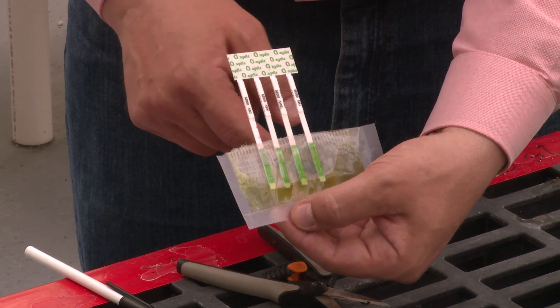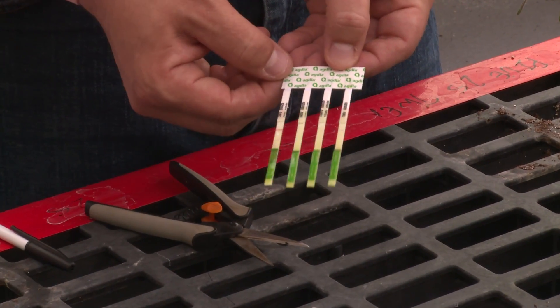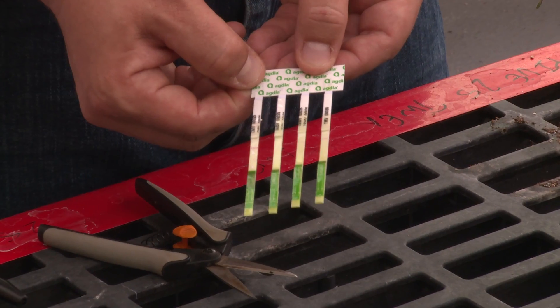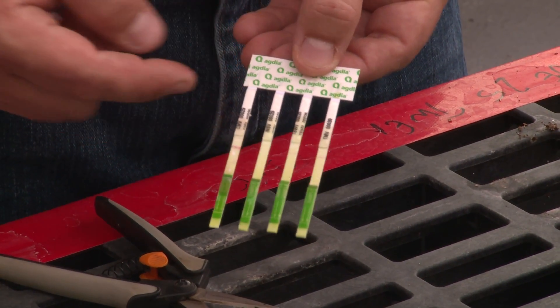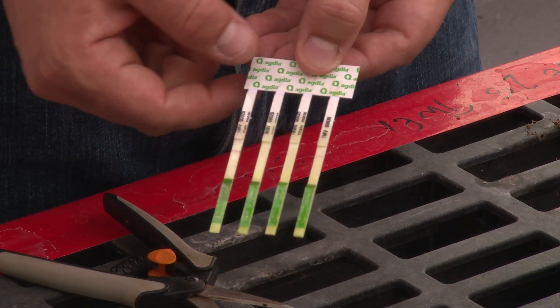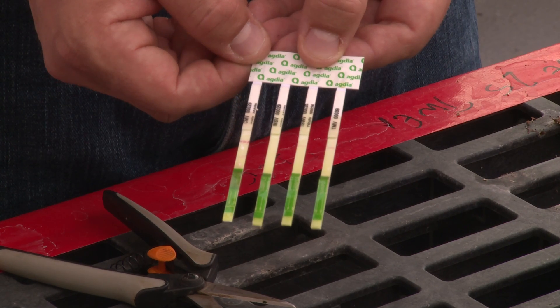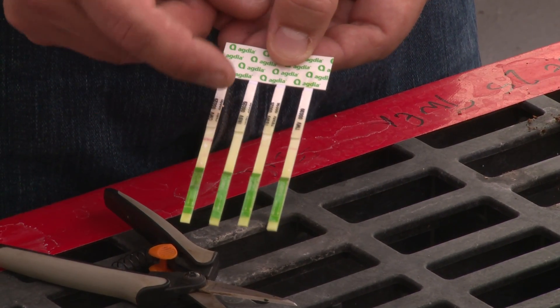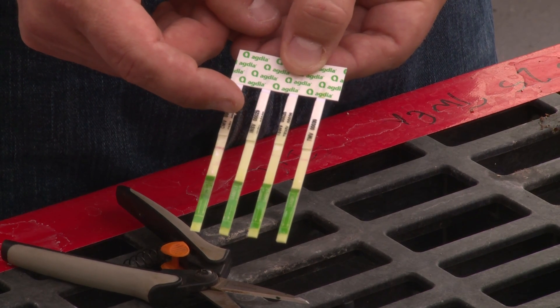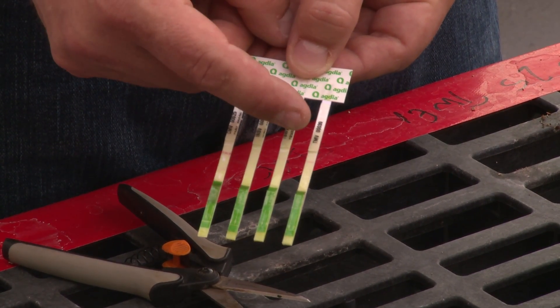Let's go ahead and take a look at a strip that's already been sitting in the solution for a while. Here we have some strips that have already been submersed in the solution for approximately 10 minutes. You'll see that there are four different strips on this specific kit — each strip tests for a different virus: cucumber mosaic virus, impatiens necrotic spot virus, tomato spotted wilt virus, and tobacco mosaic virus.